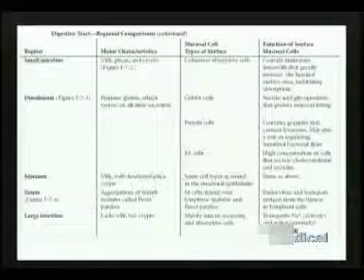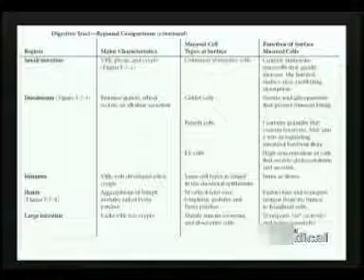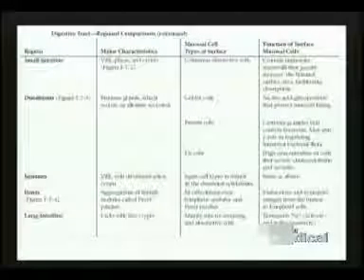As we move now down to the portions of the small and large intestine, as we alluded to earlier, we certainly can say that a common feature of all parts of the small intestine, duodenum, jejunum, and ileum, is the presence of the absorptive simple columnar epithelium, but basically the characteristic features are that all parts of the small intestine are thrown into prominent villi, folds, and interdigitated with crypts of Lieberkühn. So we have to use other criteria histologically to distinguish a section of duodenum from jejunum and ileum.